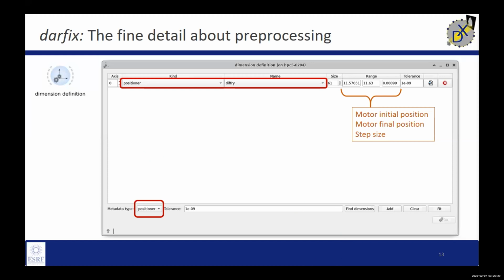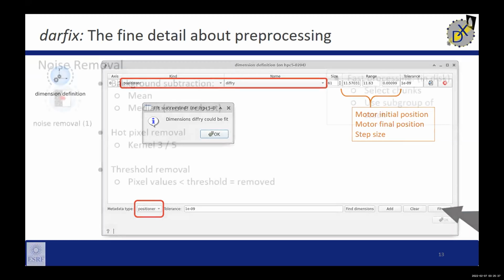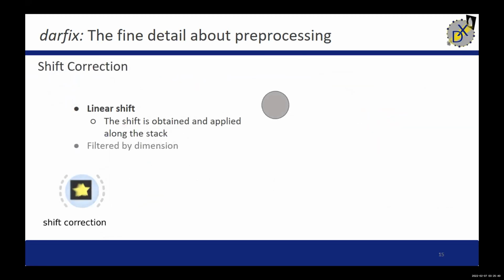One question maybe from my side. I noticed when I used the shift correction that there is a star-like distortion in the scan afterwards, and I have to apply a second noise removal with a pretty low threshold so that this gets removed. Is this some error on my part, or can this happen? It's not a problem on your part. When you apply the shift correction, you actually have all these pixels in this place, which induces some noise around the shape of your material.